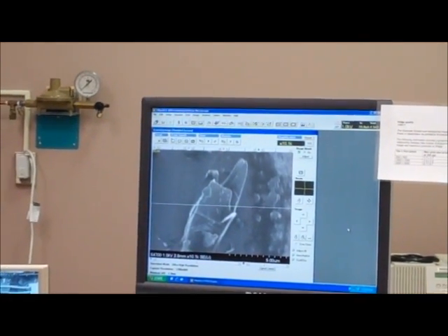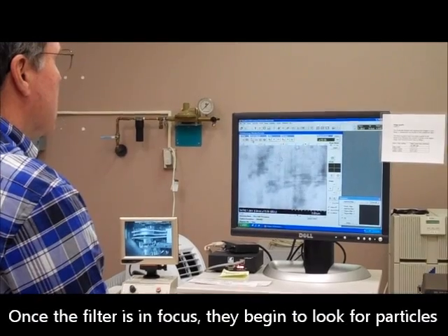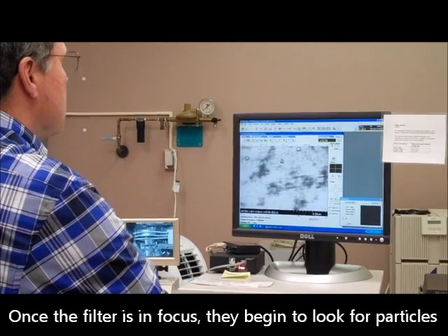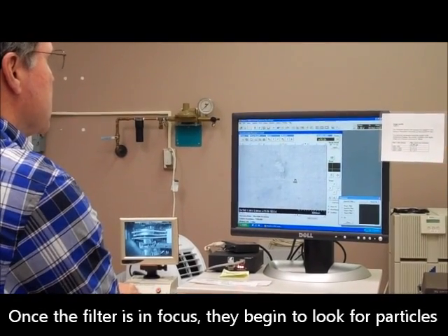So that's the size of the features that we're interested in. See, here's more particles here. Oh, there's quite a bit of particles right here.